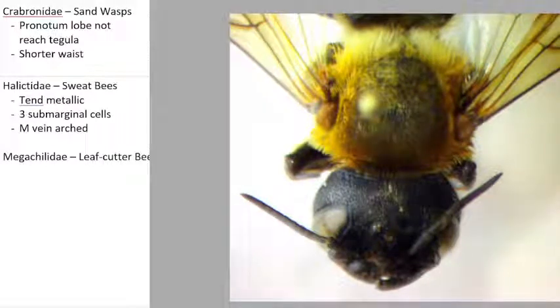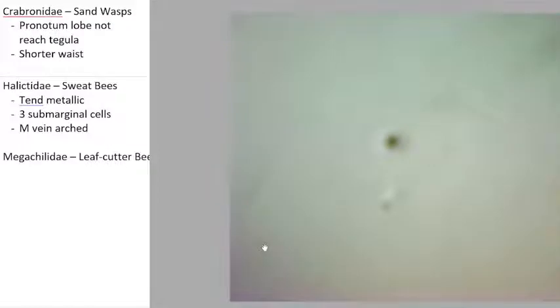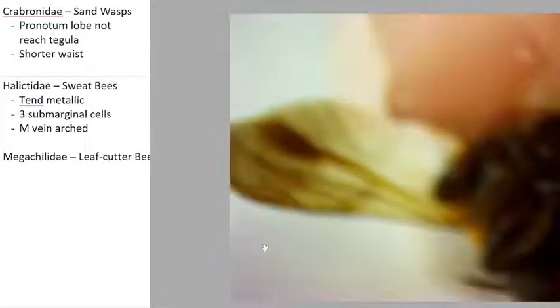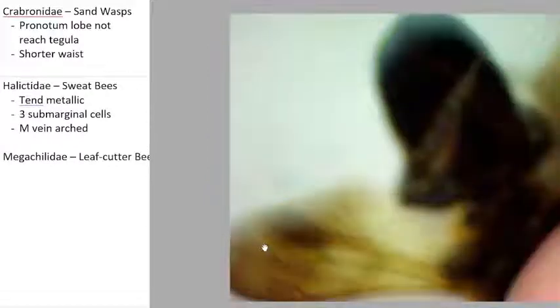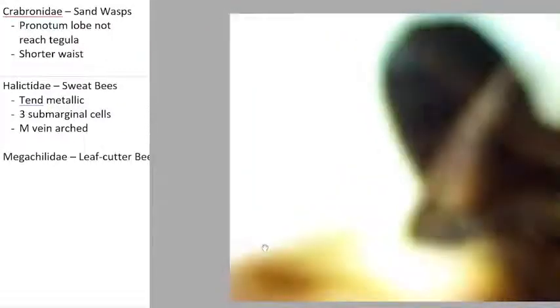All right, so with the megachilids, I wanted to show you the scopa. So that means I'm going to have to take off the labels. Give me a moment. I've got to flip this specimen upside down. You'll notice I just did something kind of strange. I put museum tack on my microscope. This is to help hold my pin upside down while I show you the scopa.